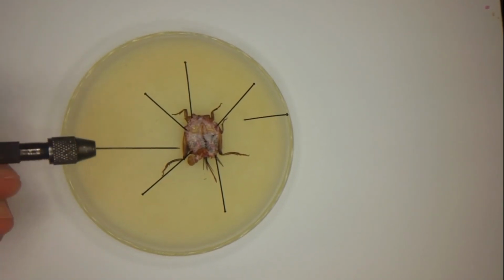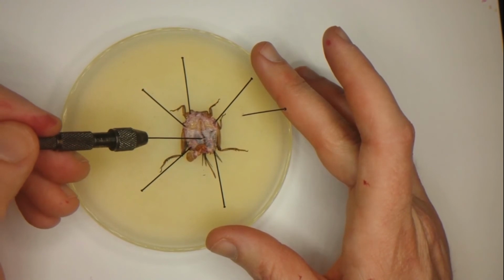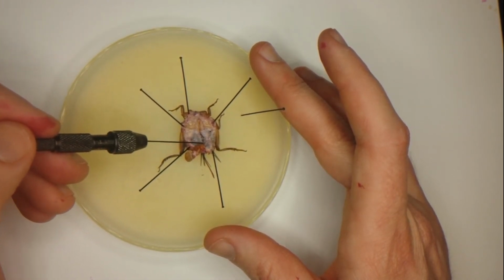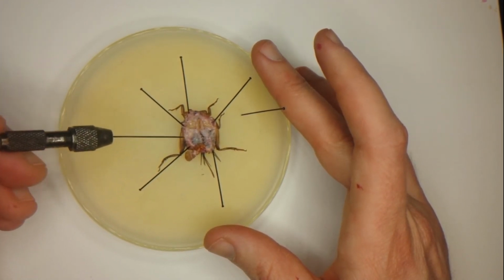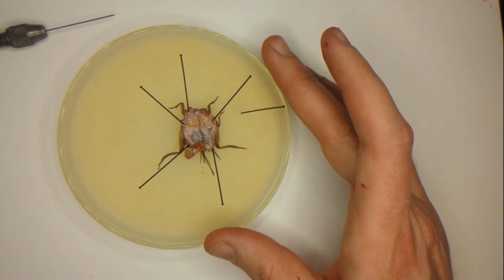I forgot I wanted to point out one more thing before I move on to that next step, which is it's also possible to see some of this cricket's tracheals. They're these shiny white tubes running along the surfaces of the abdomen. And there's also a set of tracheals that runs right along these flight muscles to help ensure that they're well supplied with oxygen during flight.